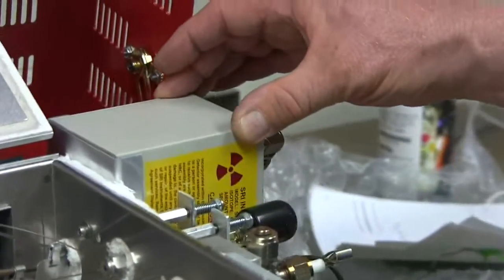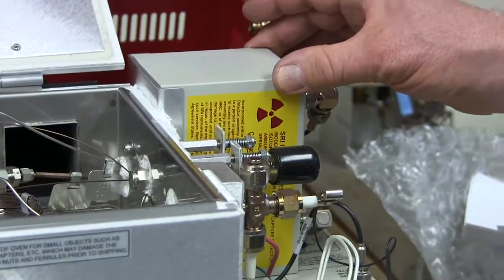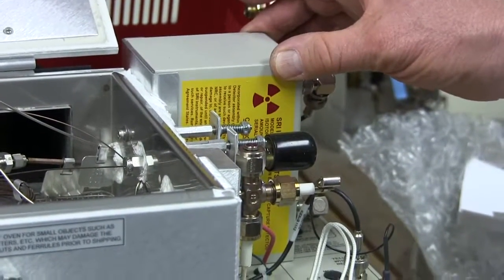This is the electron capture detector. This is a radioactive detector. You can see the radioactive mark here. We abbreviate that as ECD, electron capture detector.